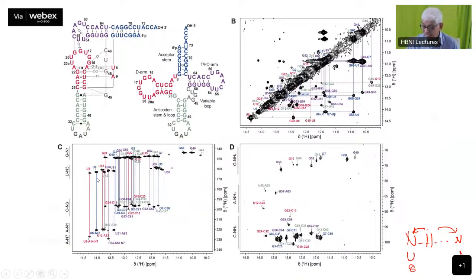This will allow you to identify the nitrogens of the individual base pairs. Therefore, you can figure out how the base pairing scheme is happening in your DNA sequence or the RNA sequence. All of this becomes very important in the case of very complex molecules. Otherwise, the proton spectrum alone will not be able to tell you all of this. The pairwise correlations seen here were extremely important to identify the structure of such large RNA molecules, especially the tRNA. tRNA is very, very complex.